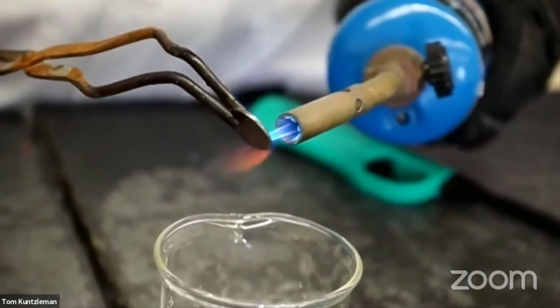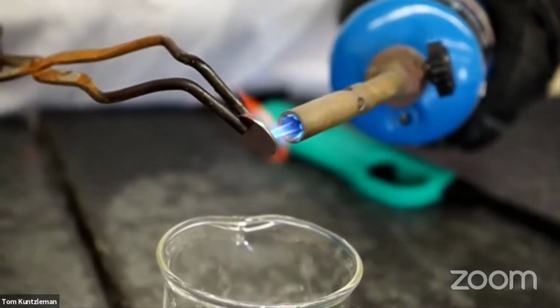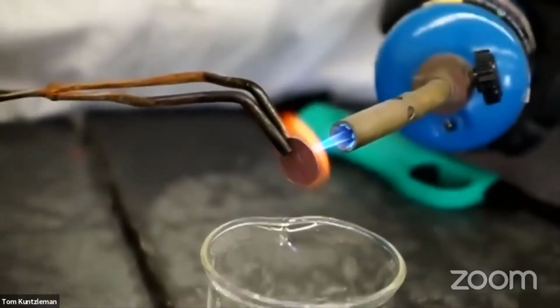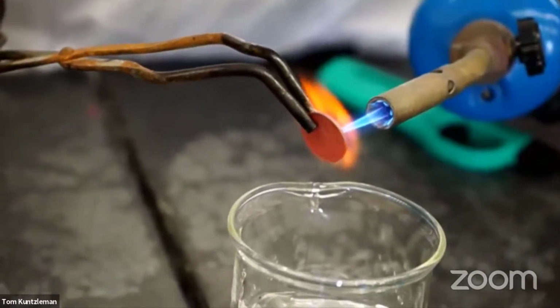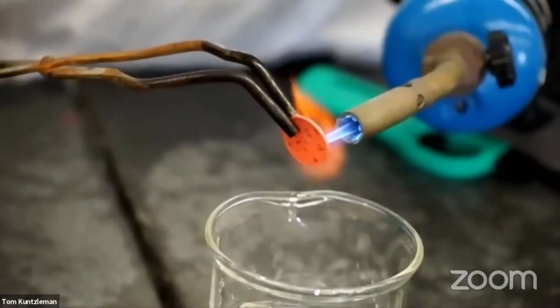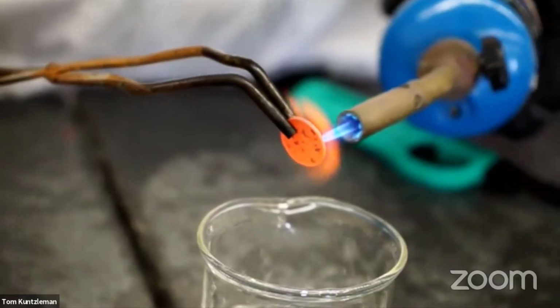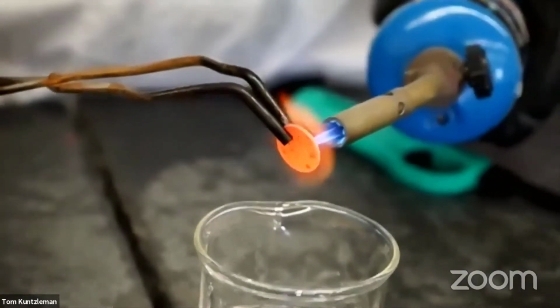What's going on? Is it going to melt? Something's happening. Is it melting though? I don't think it's melting. Oh, it's starting to glow. Look at that. It's getting orange hot. It sure is. It's glowing orange. It's so hot. I've got this thing so hot and yet it won't melt.